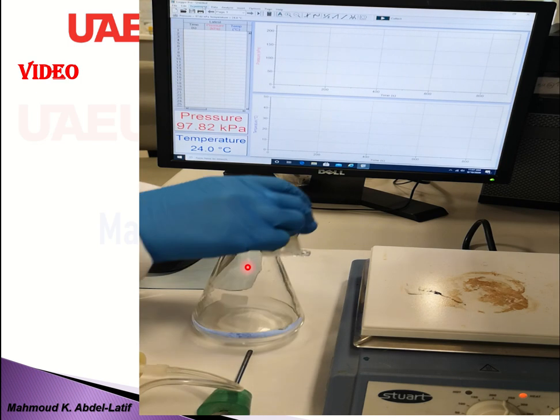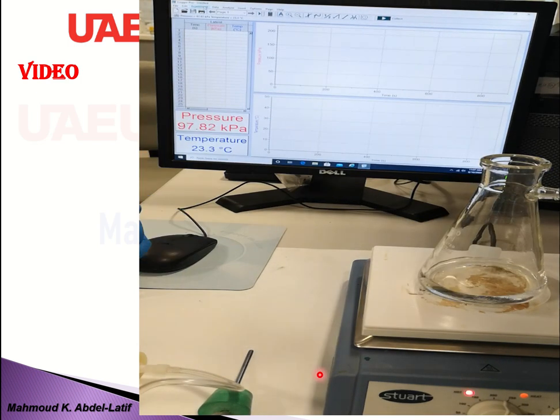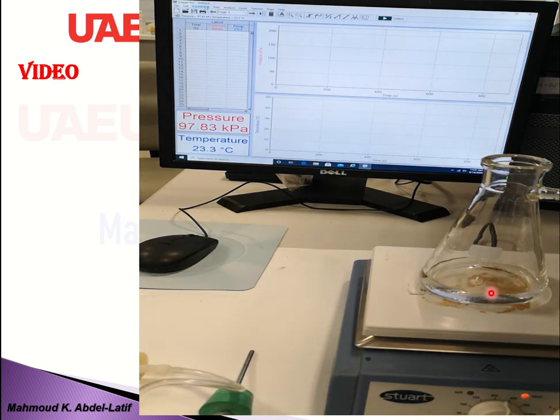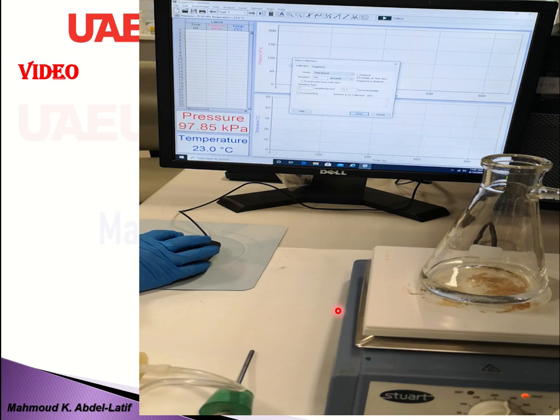Then add boiling beads, and put it on the hot plate, and wait some time until the solvent boils for some minutes.